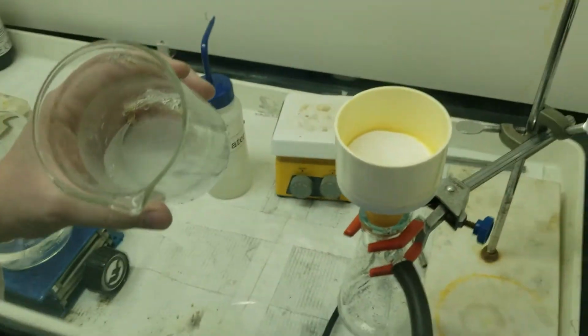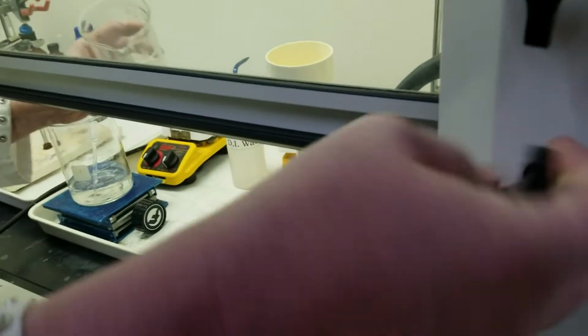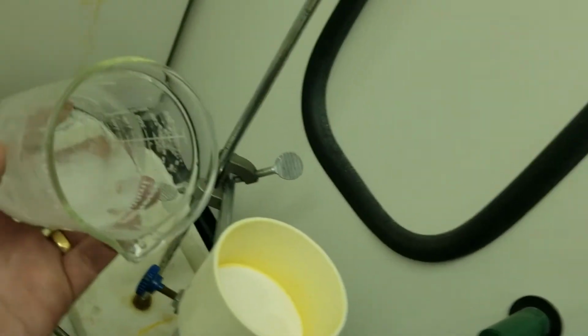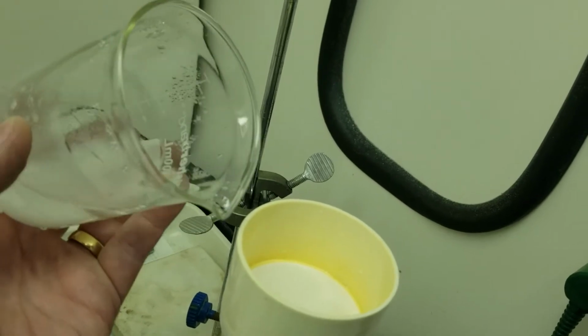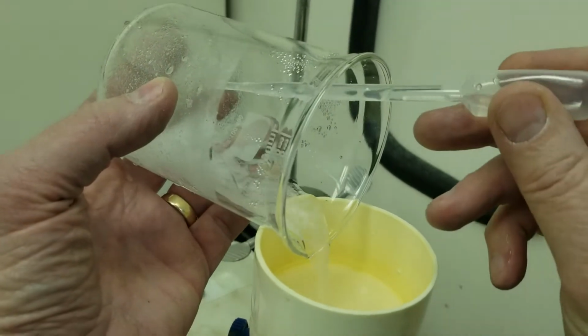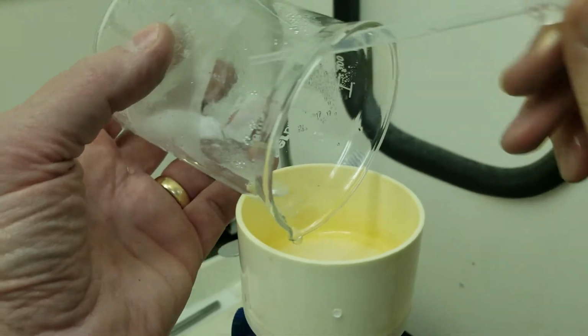We've been icing it for 5 minutes. We're going to turn the suction on. Use ice cold water to filter with. We're going to try to take as much of that product out as we can and put it over here in the filter paper. First I'm going to pour off all the liquid, and then I'll start squirting in the crystal.